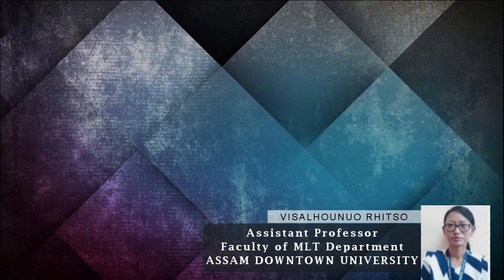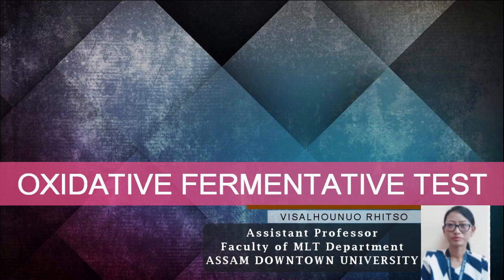In this video, I'll be explaining the oxidative fermentative test. The oxidative fermentative test was developed by Hugh and Leifson in 1953. They developed OF media to differentiate between oxidative bacteria that produce acid from carbohydrates under aerobic conditions only, and fermentative bacteria that produce acid both under aerobic and anaerobic conditions.